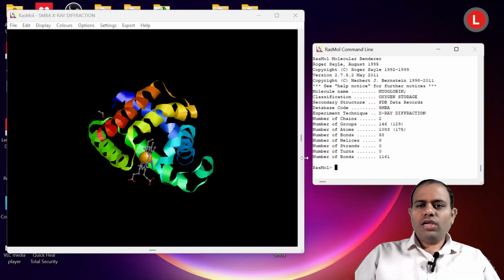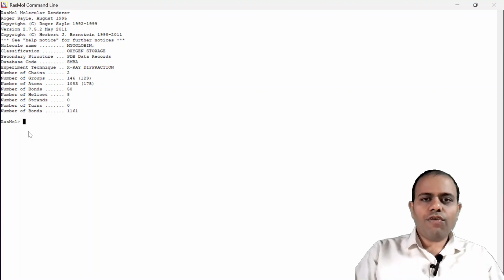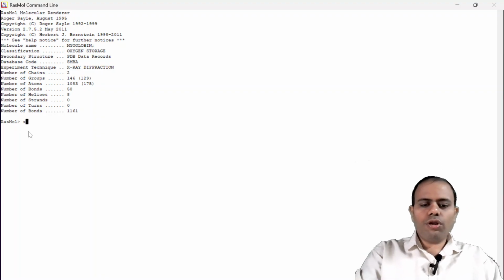First of all, you are getting certain information about the protein structure. But if you are not getting the information, just put show information.